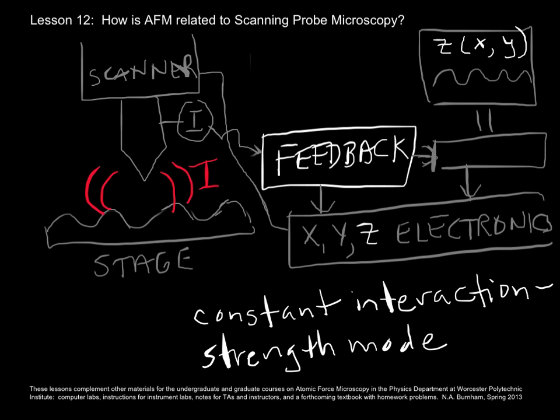But in AFM, of course, it's constant force mode, because that's the thing that we're keeping constant.